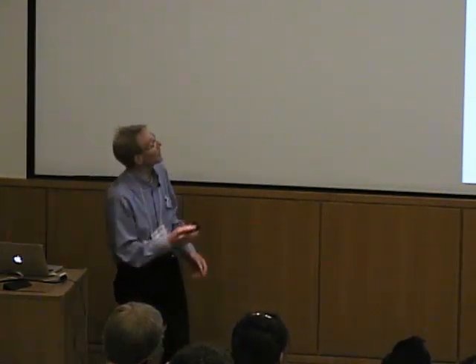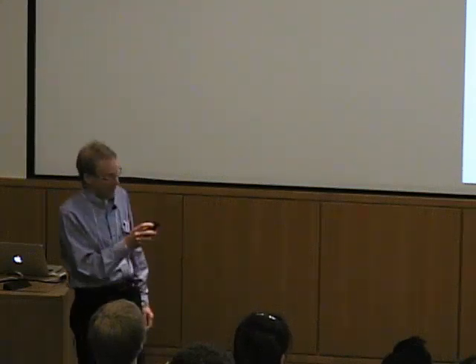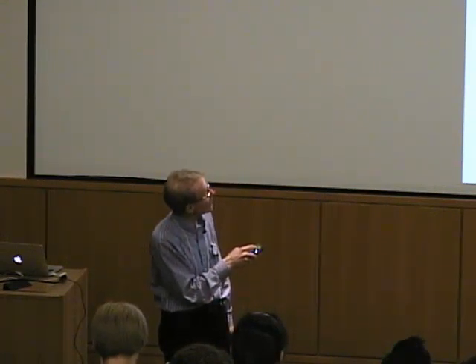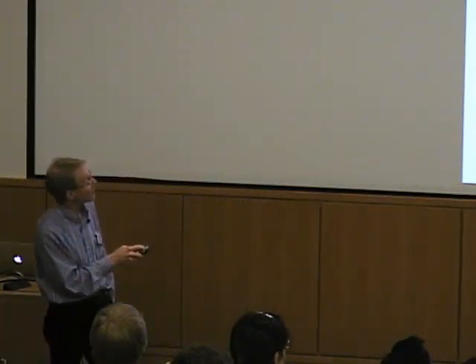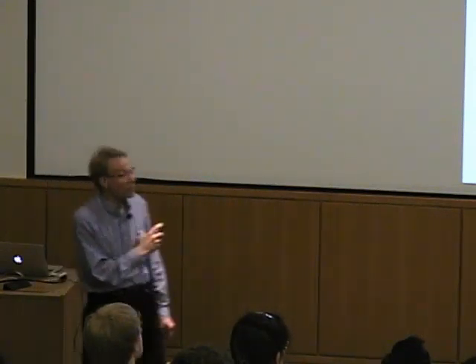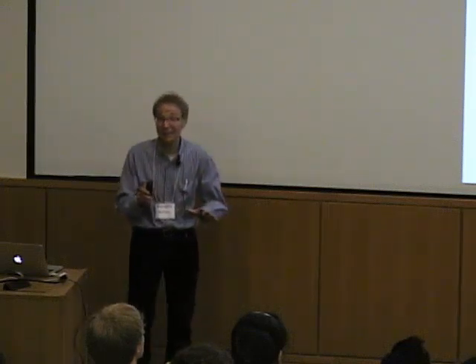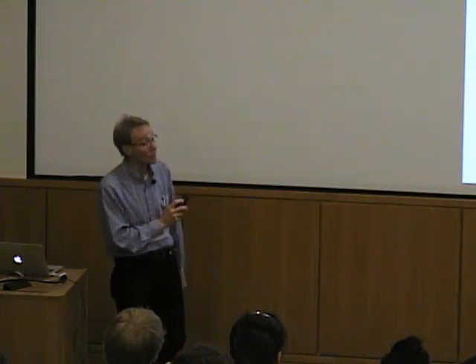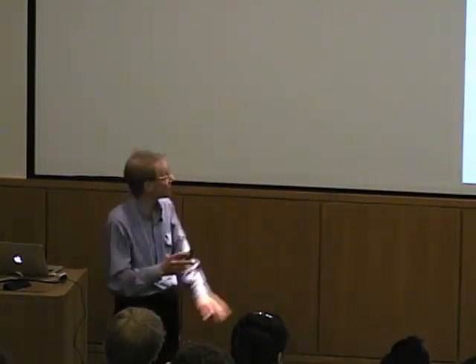Okay, copper-1 binding. Now, copper-1, of course, is trickier. All right, you've got to worry about oxidation. You do it in an anaerobic environment. You have to worry about disproportionation that occurs with copper-1, disproportionating to copper-2 and copper-0. Fairly favorable. So we're going to use copper-stabilizing ligands. Okay, that will help to suppress that side chemistry that we have to worry about.